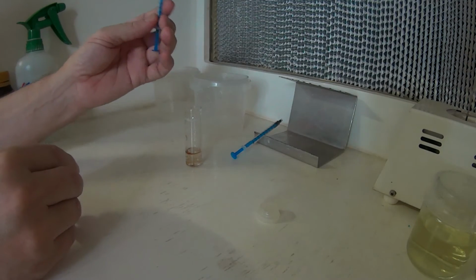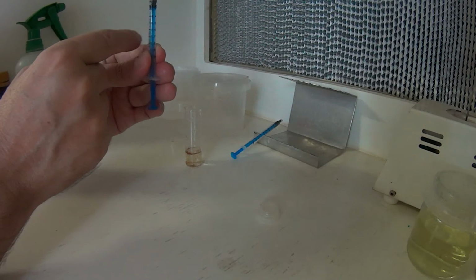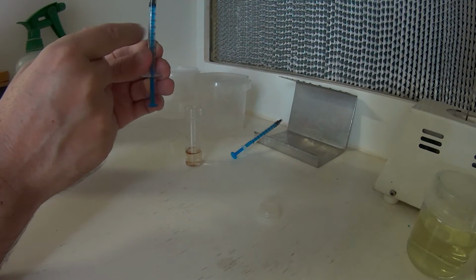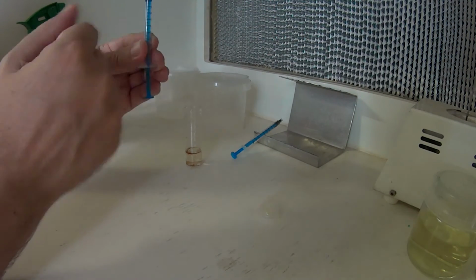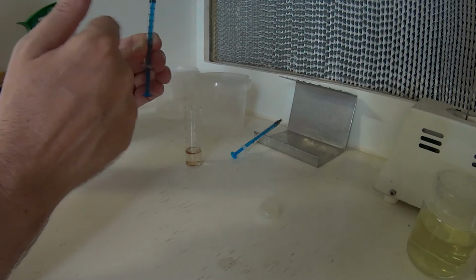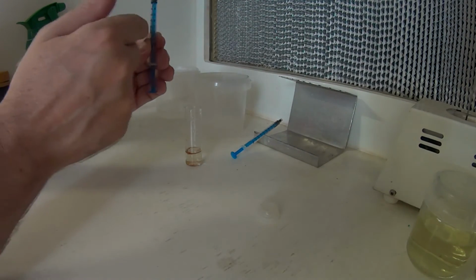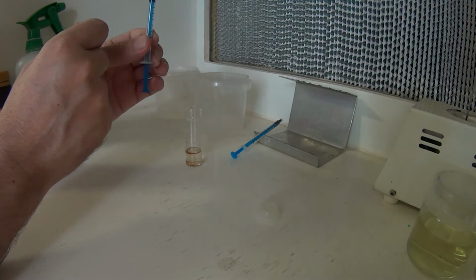So now it's a simple matter of reversing what we just did. Give it a tap, we'll get all the seed hopefully to rise to the top. Just a gentle tap every now and then so we can directly inject that into the tissue culture container. Not too much of an agitation, as you can see. I gave it a bit too hard there, and all the seeds mix back in with the fluid.